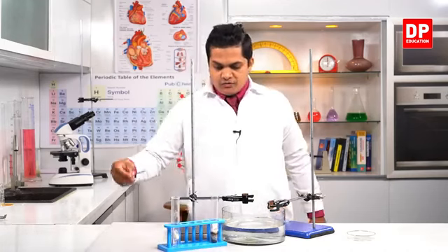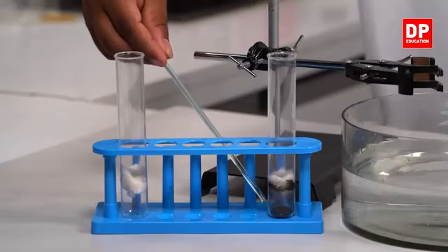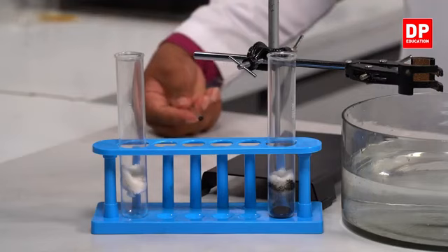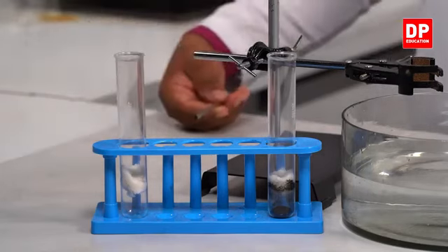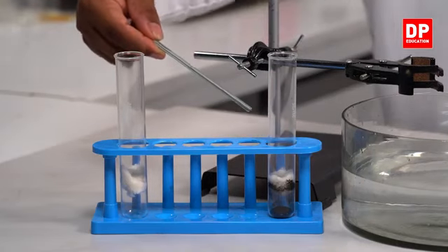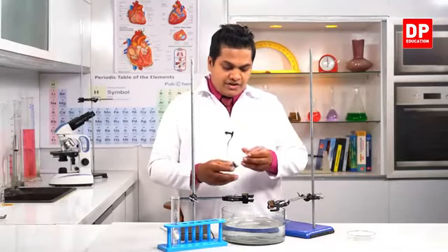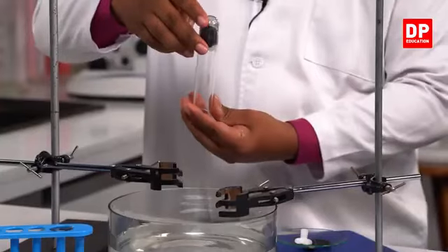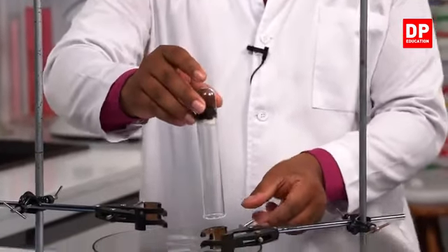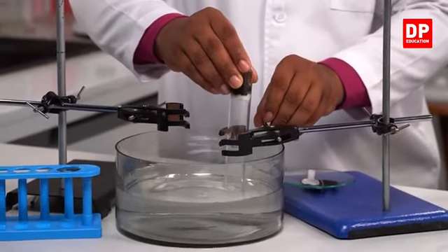The first boiling tube contains cotton wool and some amount of iron filings, or iron powder, which is trapped inside the boiling tube. In the second one, there is only cotton wool, the same amount as I inserted into the first one. Now I'm going to insert these two boiling tubes, inverted like this, into our water trough.